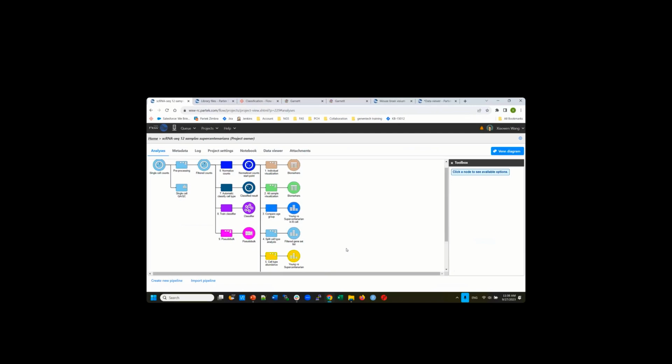It's not because they express zero, it's because your sequencing depth is not high enough to sequence this gene, because the sampling is random, right? So the bandwidth is not that great. Maybe in the future it will be less expensive and you can sequence more. This problem will be less, but currently dropout is a problem. So we have a way called pseudobulk.